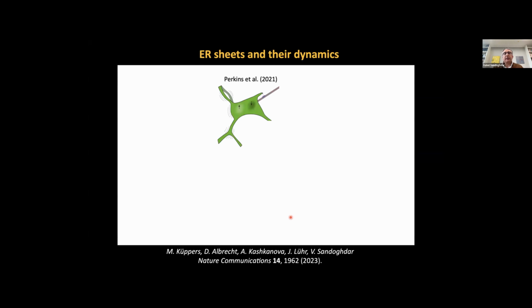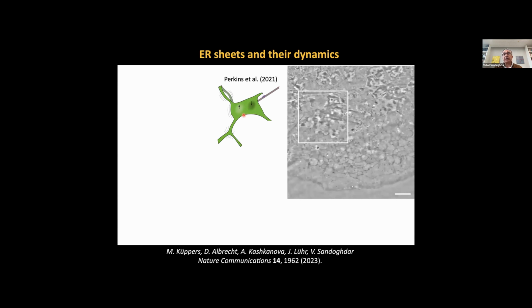Another interesting thing was when we applied this method to different cellular events. There are also ER sheets. So there are the endoplasmic reticulum tubules that we've seen, but there are also parts that form something like a carpet. It had been hypothesized that this sheet, kind of like a drum skin, might vibrate in different ways. And we think that we actually have seen this now using the great axial sensitivity of iSCAT.